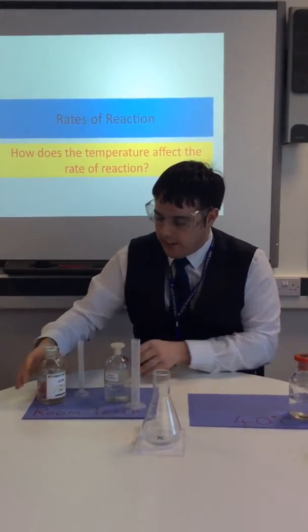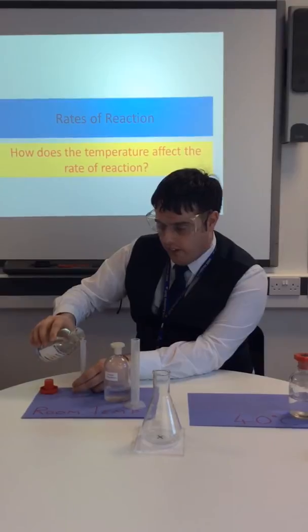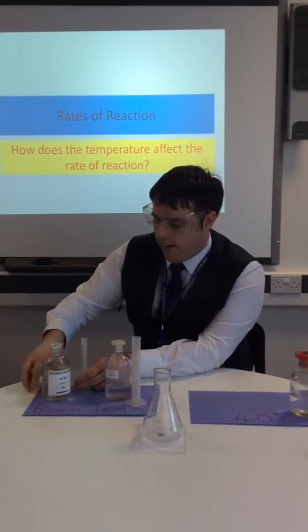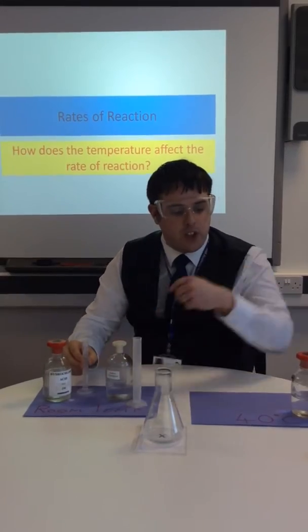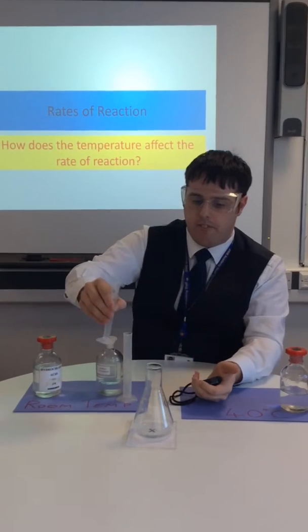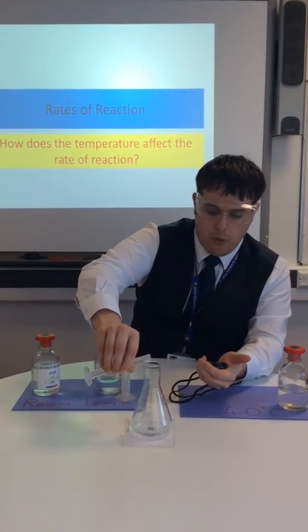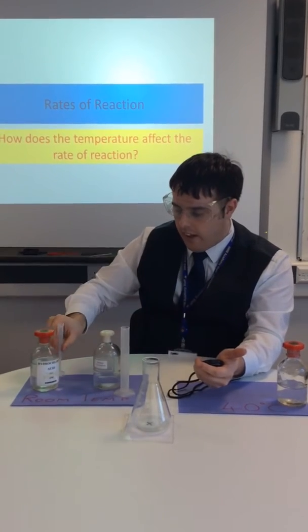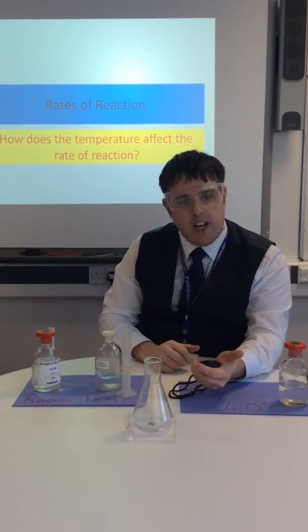So I'll measure out my 10 ml of hydrochloric acid, and then I'm going to get my stopwatch. As soon as I put this in, I'm going to start timing. 3, 2, 1. There we are. And now we just need to wait for the reaction.